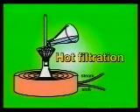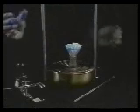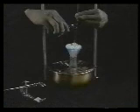Use a heated, short-stemmed funnel containing a fluted filter paper sitting in a heated Erlenmeyer flask. This flask should contain a few milliliters of recrystallization solvent. The solvent vapors will wet the filter paper and keep it in place. Pour the hot solution slowly and steadily into the center of the filter cone.